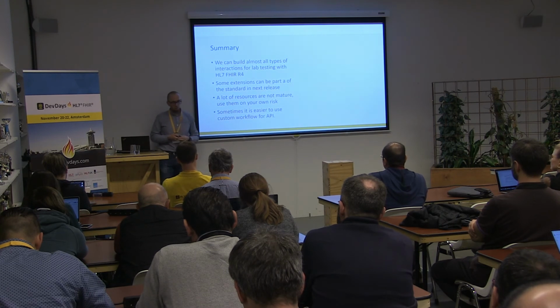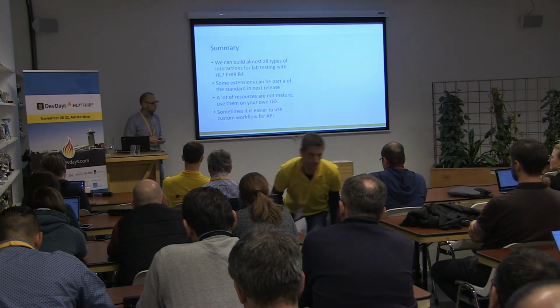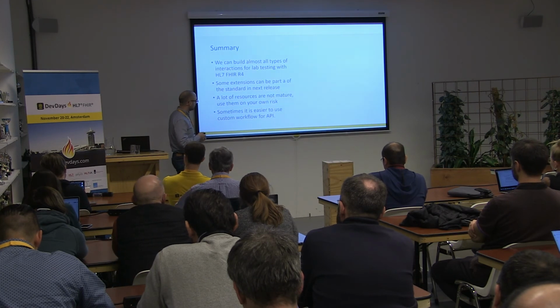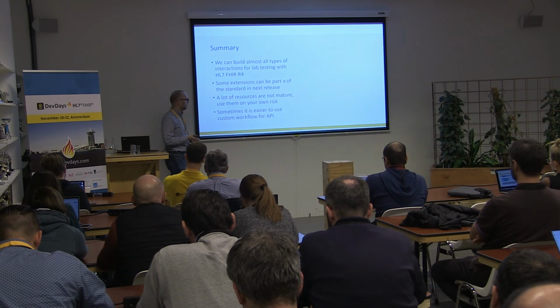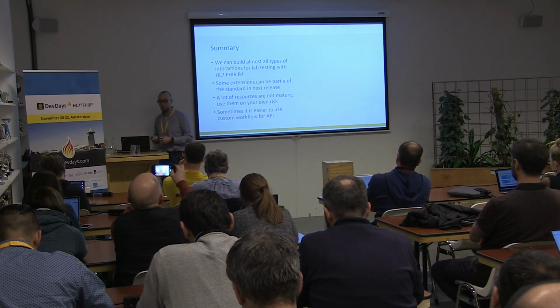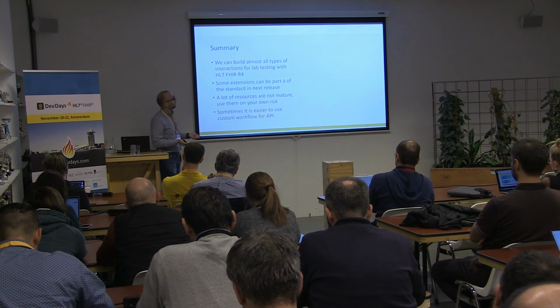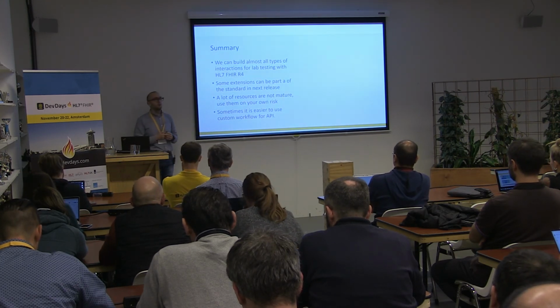But anyway, the work group tries to suggest some solutions on how you can migrate to a new version. And the last thought is that sometimes it's much easier to use custom workflows for the API and not to use only those which are described on the workflow page of FHIR. That's all, I think. Any questions?